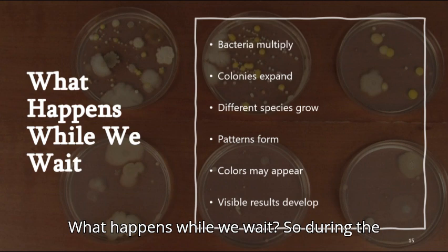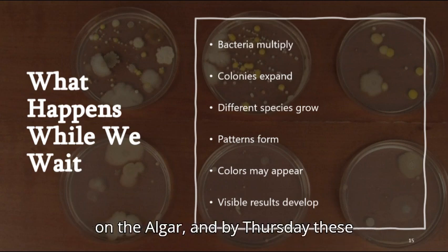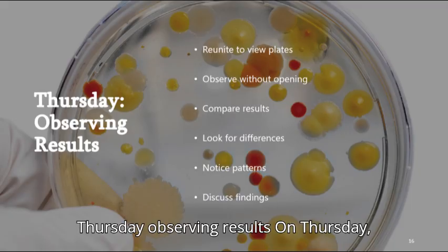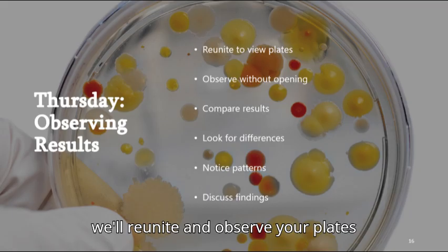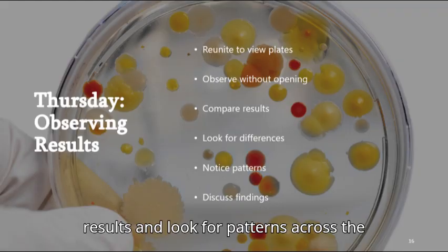What happens while we wait? During the week, bacteria multiply and form colonies on the agar, and by Thursday, these colonies should be clearly visible. Thursday, observing results. On Thursday, we'll reunite and observe your plates without opening them. We'll compare results and look for patterns across the group.